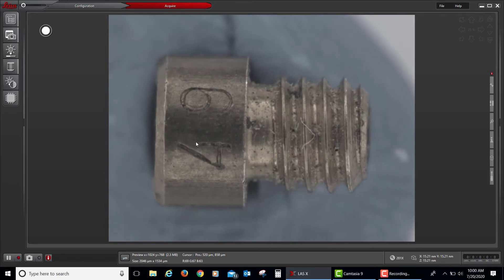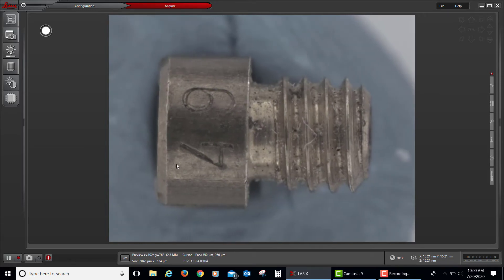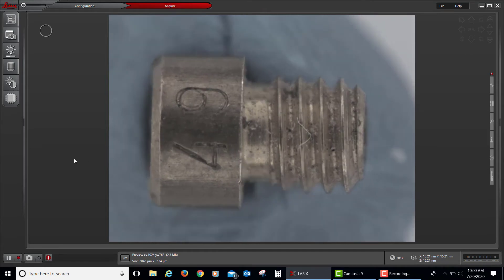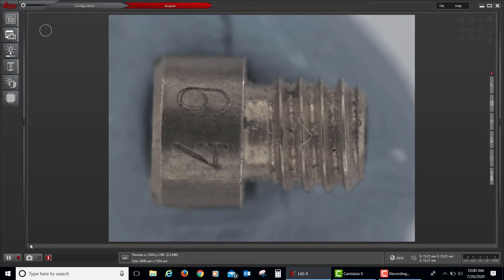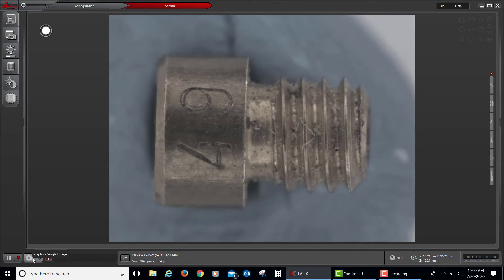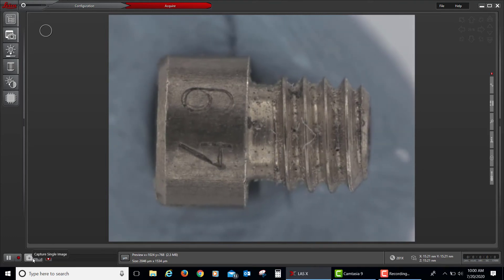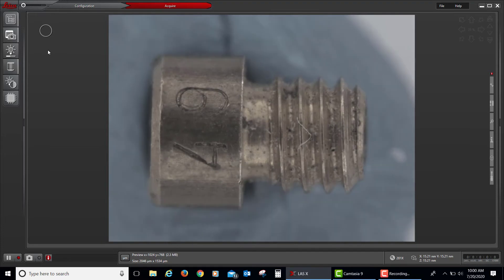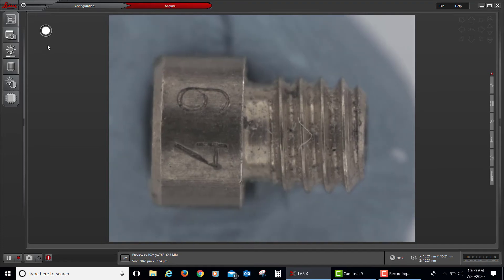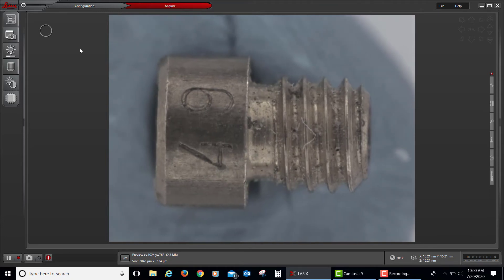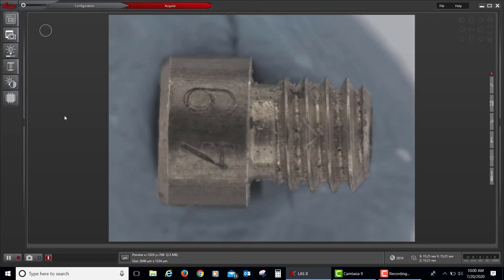In our live image here that is moving — it's a movie — I can take an individual picture three different ways. The first way is to click on the camera icon in the lower left-hand setting. The second way is to click on the flashing white button in the upper left that will take a picture. And the third way is to press the F3 button on your keyboard.